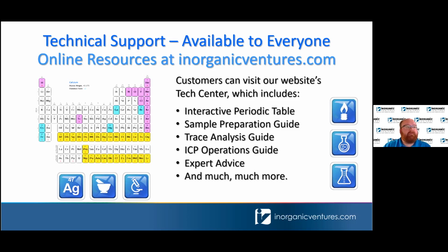Okay, great. Thank you. Next, bismuth. I have problems with bismuth because I use it as an internal standard, and problems with mercury. I'm going to start using gold. What do you recommend for bismuth? Increase the HCl some, unless you're looking at arsenic. Maybe get in touch with us about what you might be able to do.